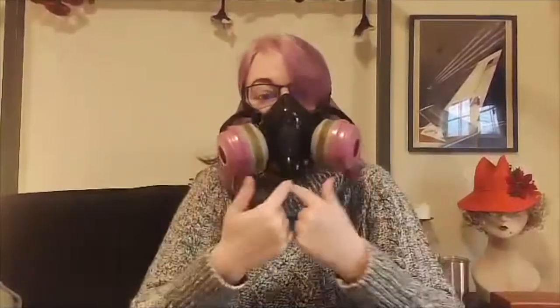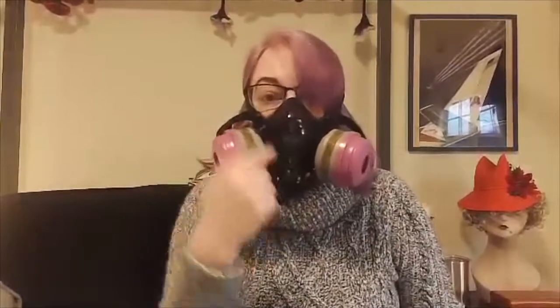My voice sounds like Darth Vader now. Cover these holes and suck in — it makes a suction. The seal is intact. If you cover this and exhale, you should feel it inflate but not blow air out. That's how you test the seal.